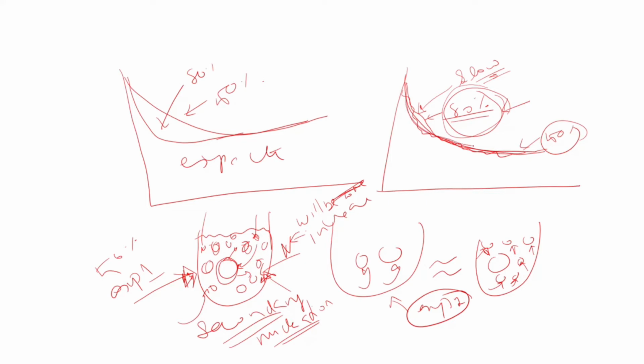They almost overlap with each other. So what you need to say is that the depletion in concentration, depletion in supersaturation with respect to time, they all look similar. And this can be expected due to secondary nucleation in the experiment 1. So just mention it in your report.